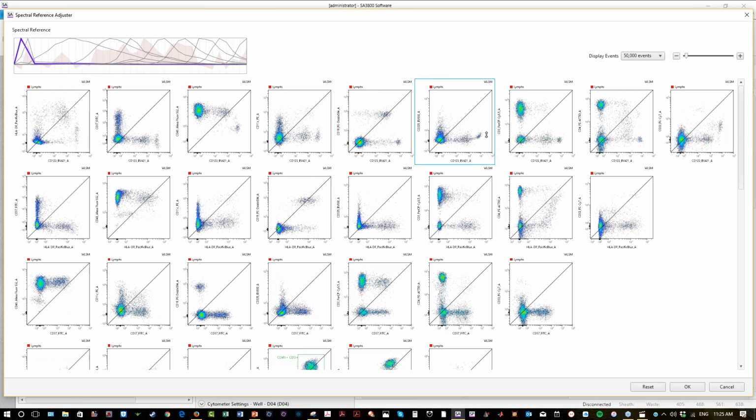Okay. And what we can do is we can go through here and look at the populations, and you can see you can place it down or you can place it too low. You can see the populations bending over a little bit. And you can see you could do it too much. So you have to be a little careful, of course, and it's just like anything we do in science, it has to make sense also at the same time.